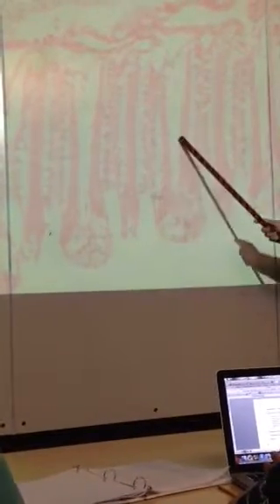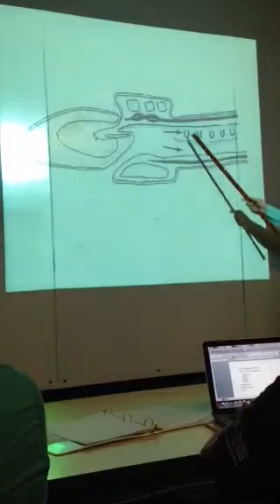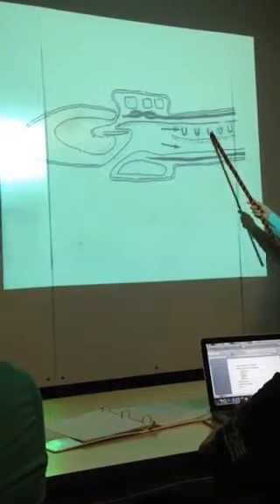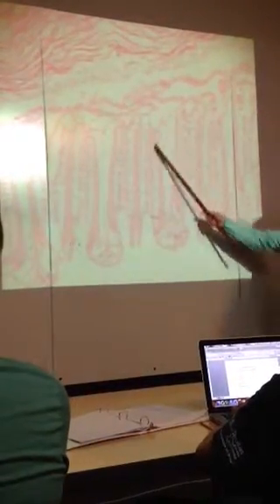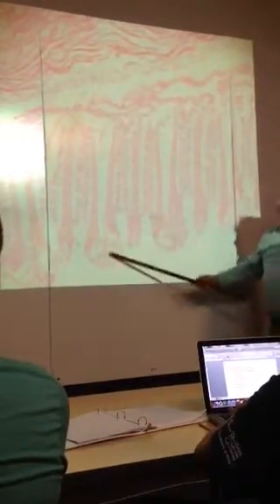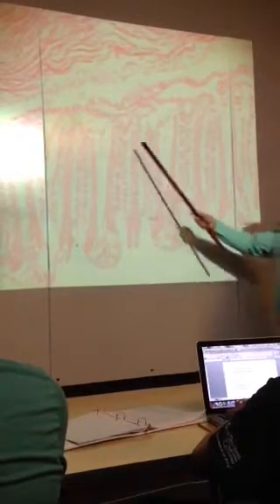Okay. The tissue here, the tongue bars. See how it comes down. In the drawing, they look like little U's, right? Go back to the drawing. See how it looks like a little U? See, come down, come down, come down, right? And then when you actually get into what they actually look like, see, it comes down like this, comes down like this, makes a little curve, and then the slits are just the spaces in the middle, in between them. Okay.